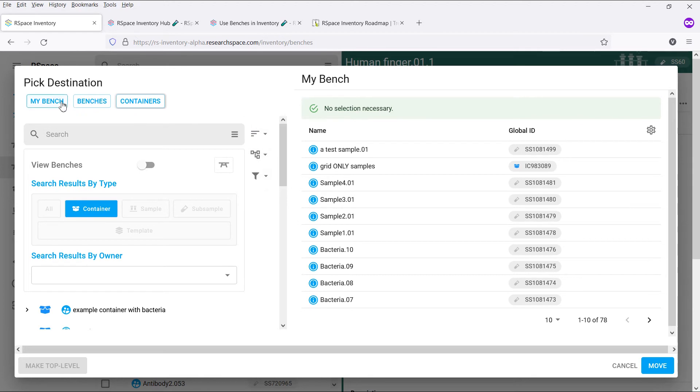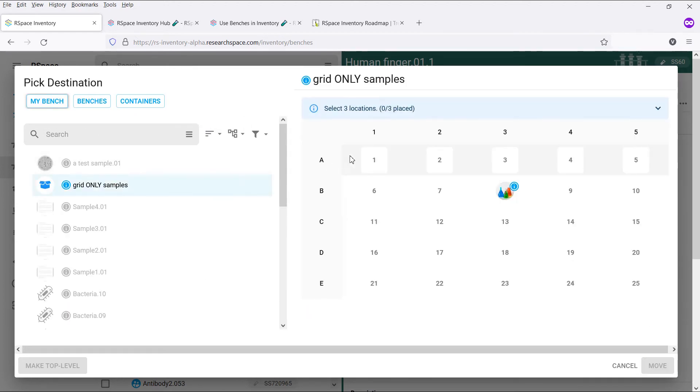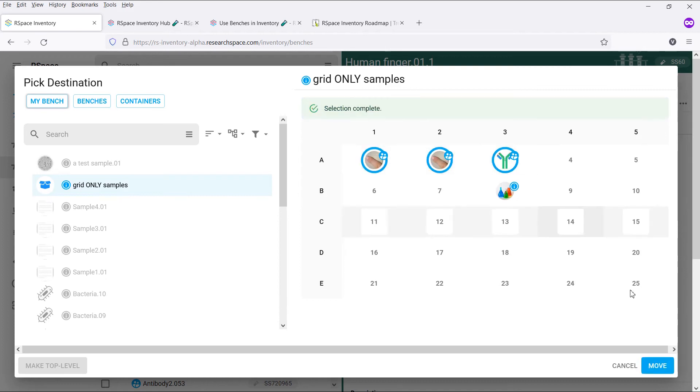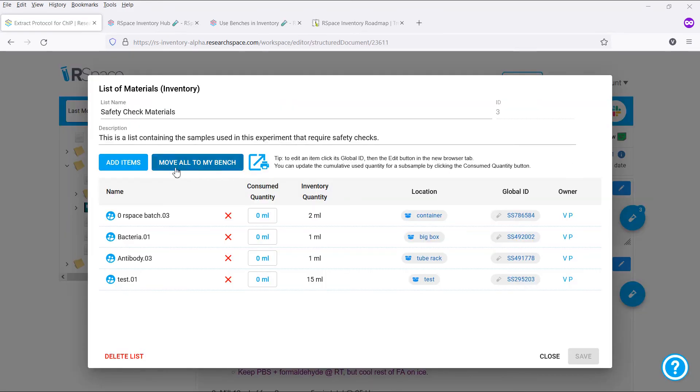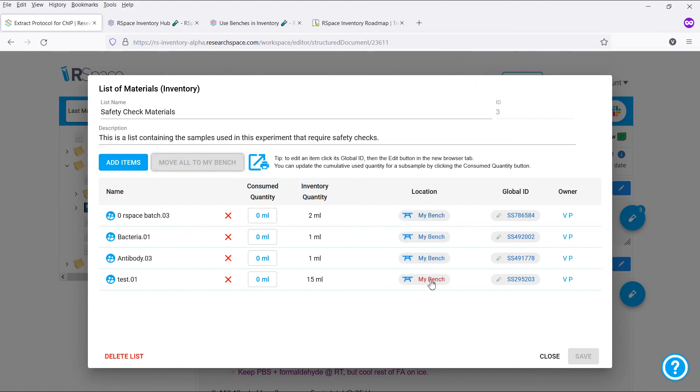Once you're happy with your selection, just click move, and your items will be moved to the selected location. For ease of use, we've also added a move all to my bench button to lists of materials, so that you can easily move all of the items needed for an experiment onto your bench with a single click.